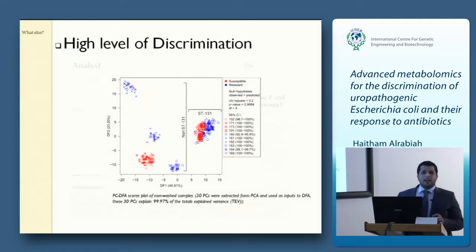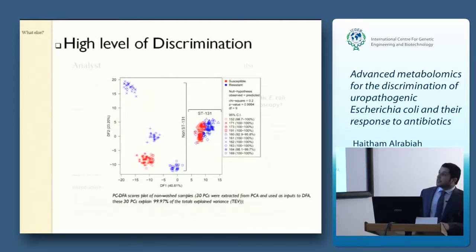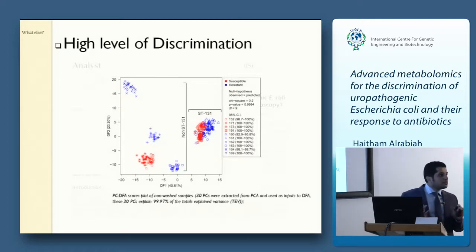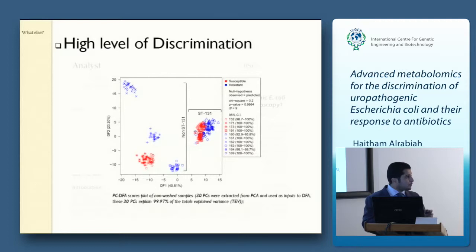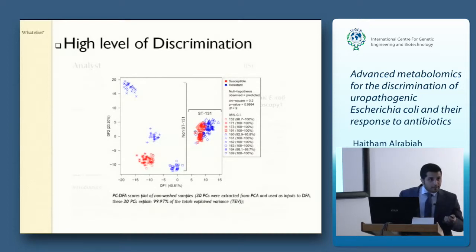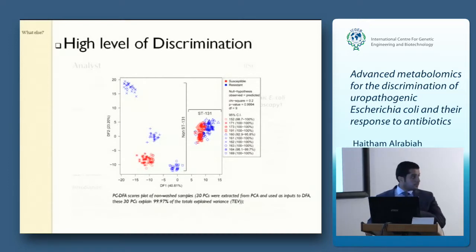There is a certain degree of sub-classification for sensitive isolates, represented by red, from resistant isolates. These are sensitive to quinolone, but we didn't mention this because it needs further investigation. So we stopped and published until this part, and in Manchester they completed the work in this area.